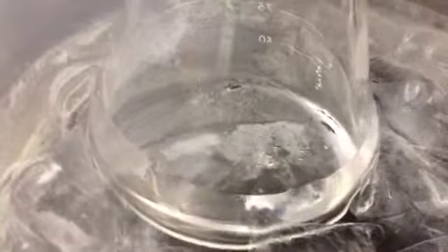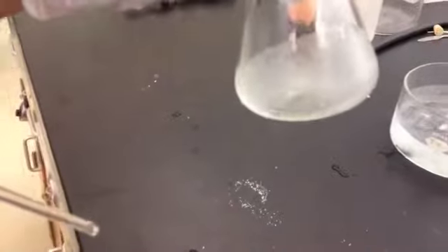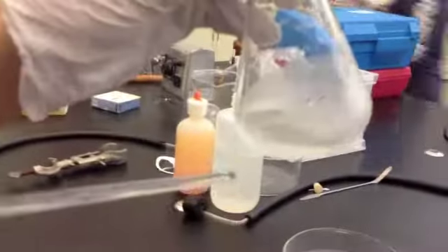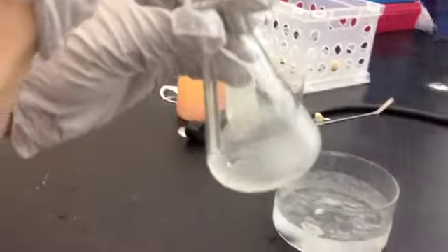And after a few minutes, it should begin to recrystallize. You'll see little precipitate forming on the bottom. Alright, so we waited a few minutes and there are no crystals forming, so we're going to try what's called seeding. We're going to use a glass rod and just start scratching the bottom of the Erlenmeyer flask with the glass rod to try to make the benzoic acid precipitate out of the solution.